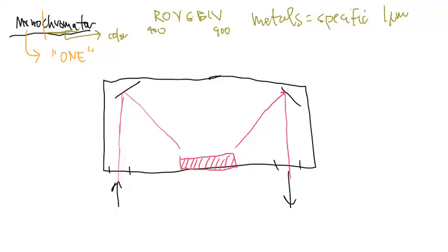Light goes into the monochromator, something happens to the light on the inside, and this one wavelength or one particular color leaves the monochromator and goes into the detector eventually. Now, what is this dashed piece that I have just labeled here? Well, this is called a grating.